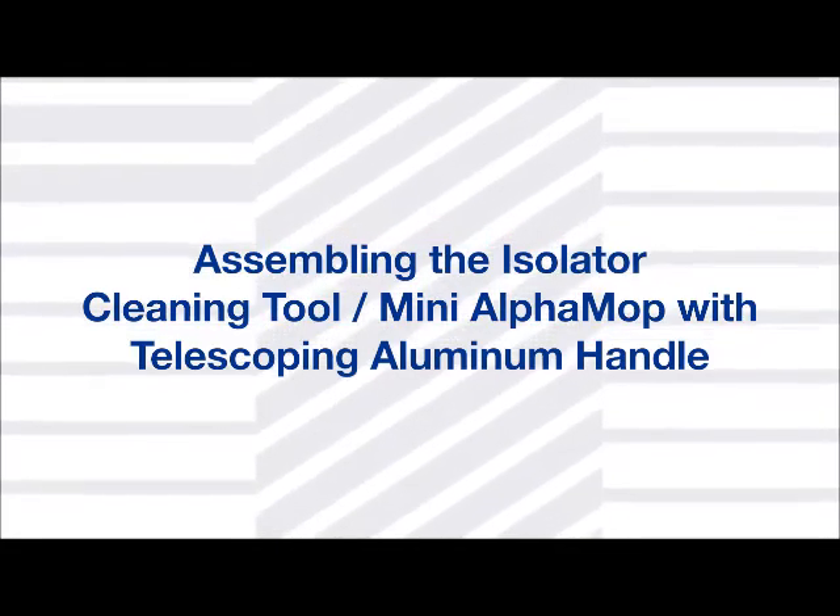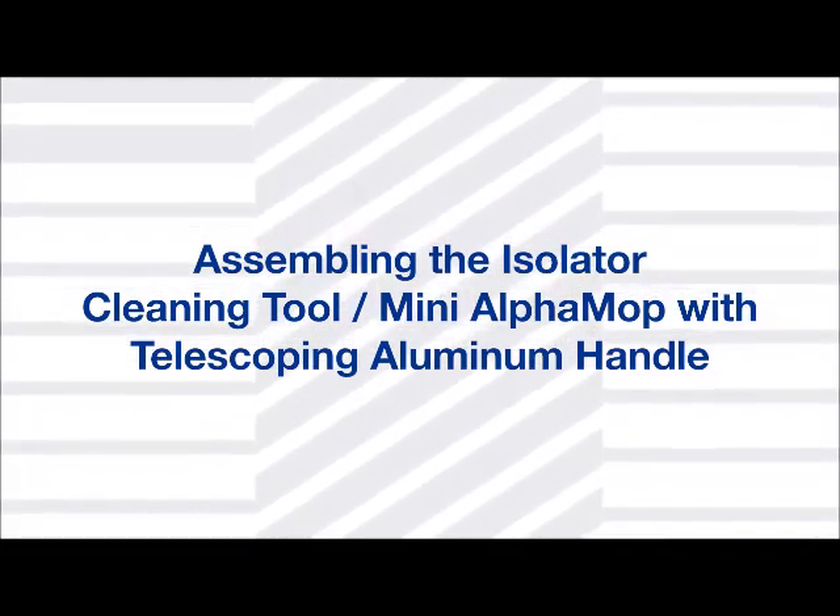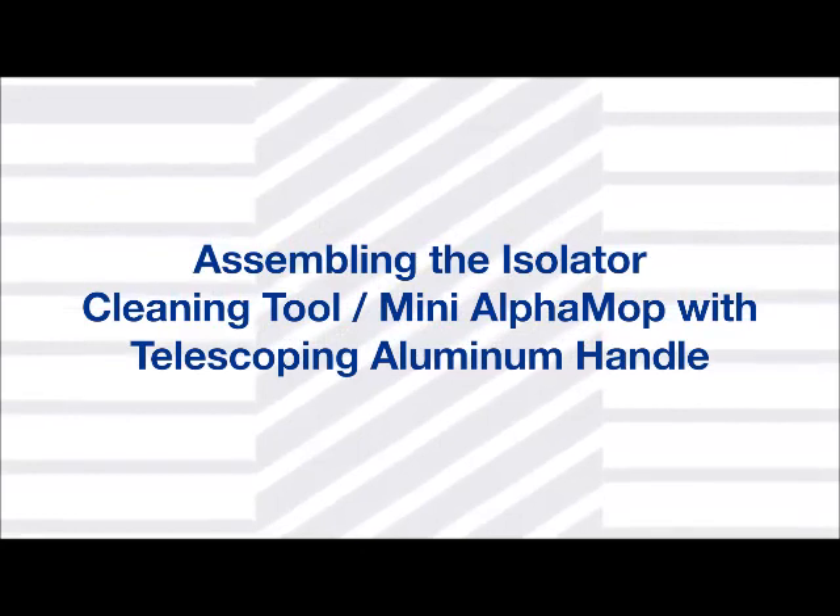TexWhite presents: Assembling the Isolator Cleaning Tool Mini Alpha Mop with Telescoping Aluminum Handle.